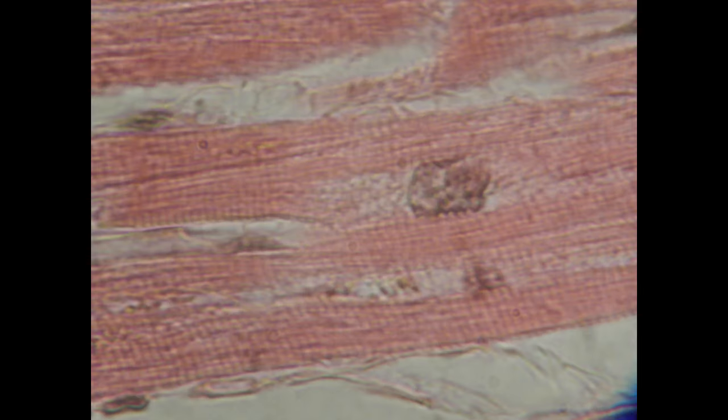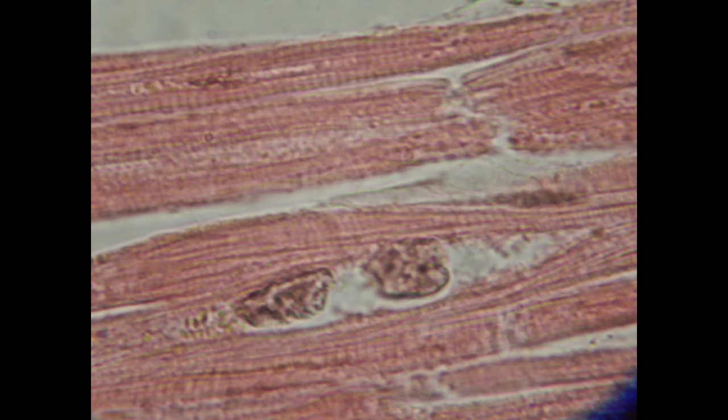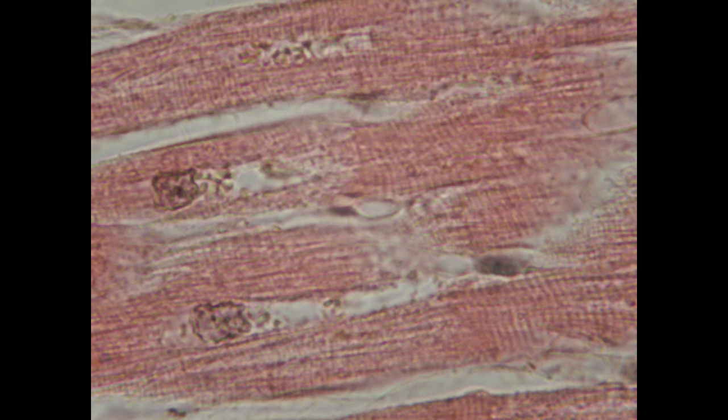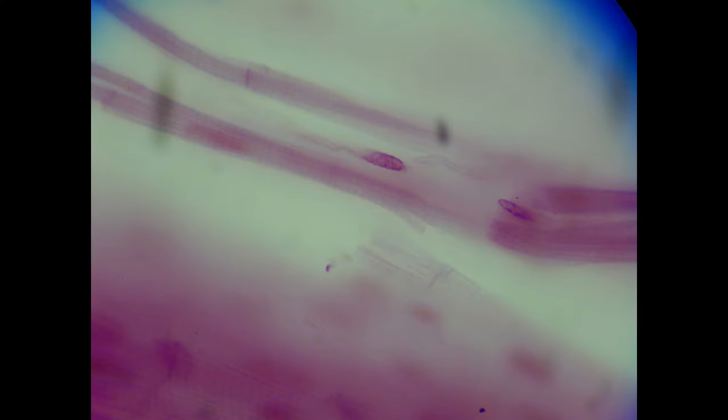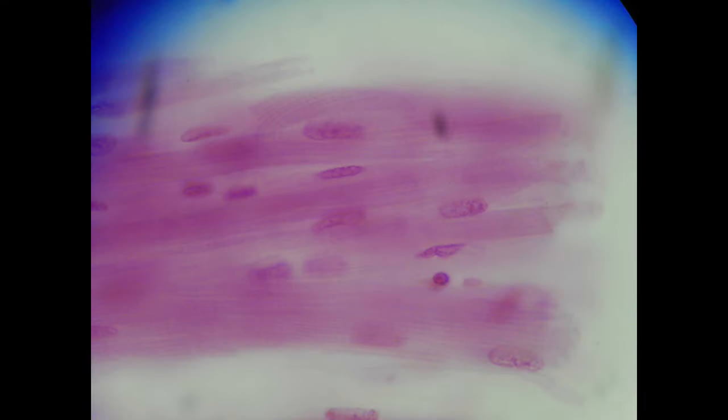If one were to compare one microscope slide to another, these tissues can be prepared differently by different supply companies. Using one slide from one company, it might be easier to see the striations, while perhaps easier to see the intercalated discs on a different slide. So one shouldn't be surprised if there are different aspects highlighted in different slides.